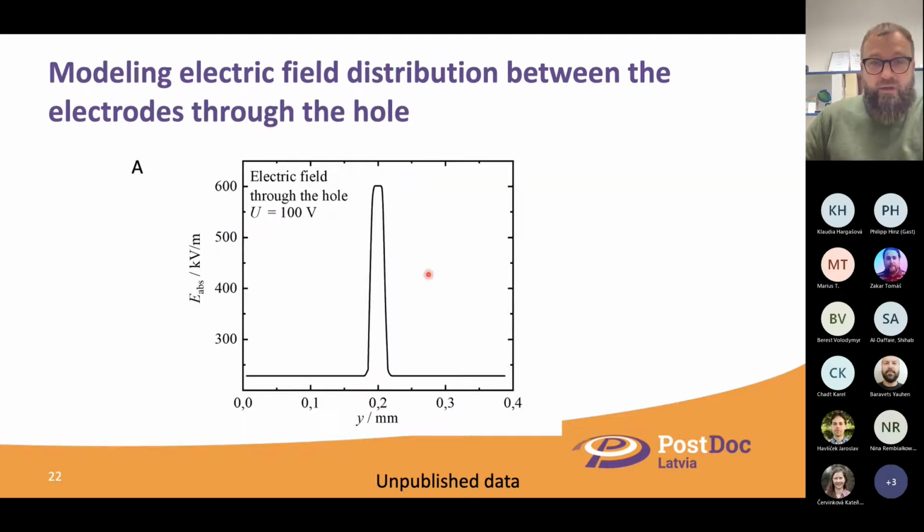And from the model, we get a very interesting result: such a structure can be used as an amplifier of the electric field.